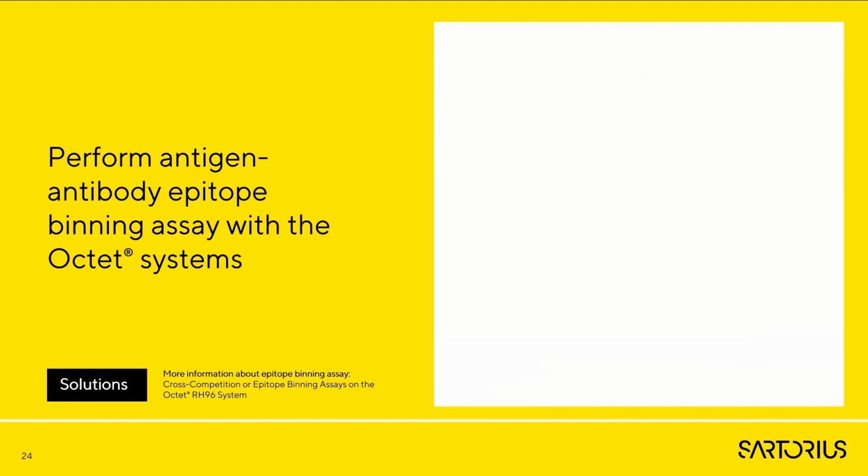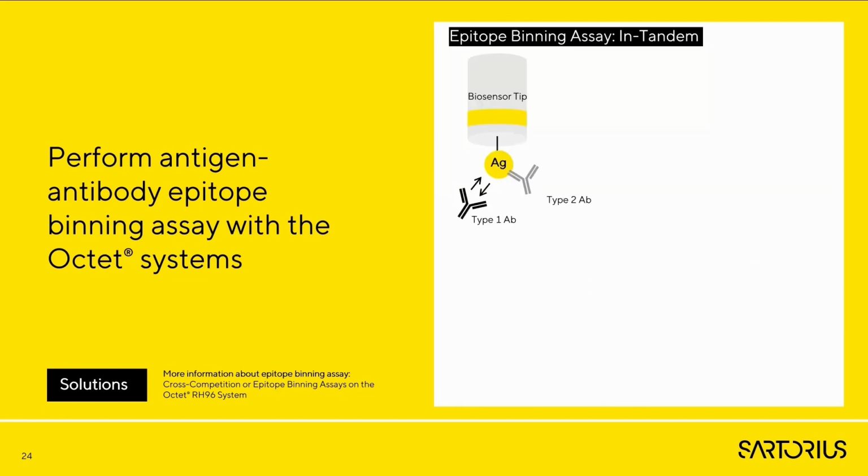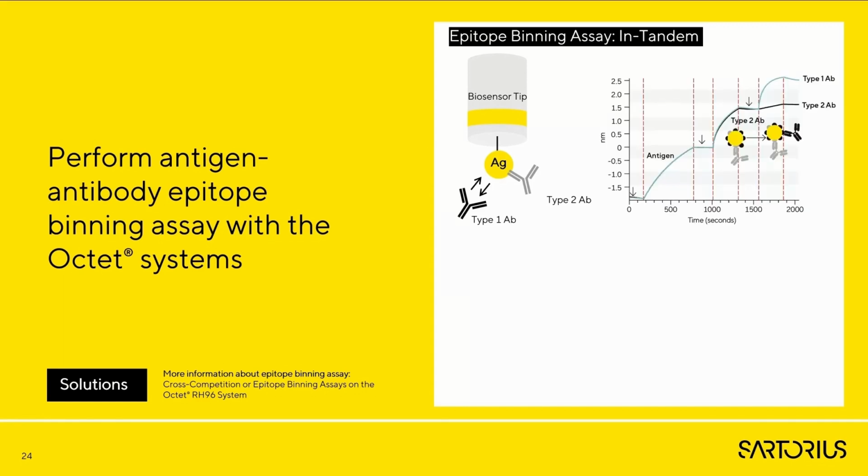We performed the test under the same conditions to check the other situation. Here we dipped the biosensor tip, which was immobilized with antigens, into type 2 antibody solution first, then type 1. When the antigen first binds to the type 2 antibodies, it produces a slower and weaker interaction, shown as a flat curve. When adding type 1 antibody, it binds to antigen faster and tighter, shown as a steep curve.